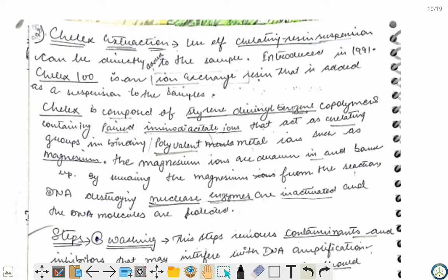and it will inhibit the activity of those DNases. Chelex was first introduced in 1991. Chelex 100 is an ion exchange resin that is added as a suspension to the sample. Now see the composition of Chelex. Chelex is composed of styrene divinylbenzene copolymer containing paired iminodiacetate ions that act as a chelating group in binding polyvalent metal ions such as magnesium.